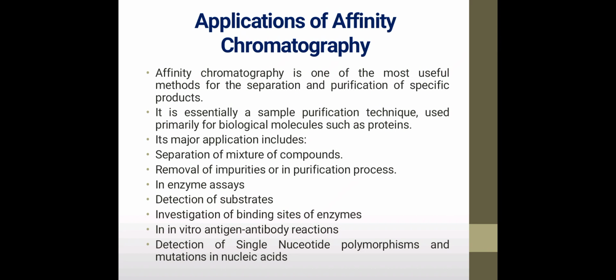Then the next one is detection of single nucleotide polymorphism and mutations in nucleic acids. So this separation technique is also very much useful for studying mutations in nucleic acids.